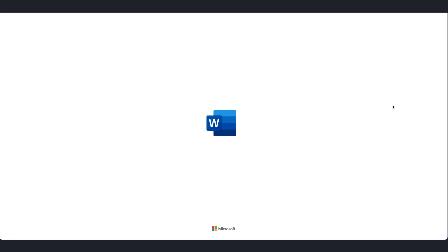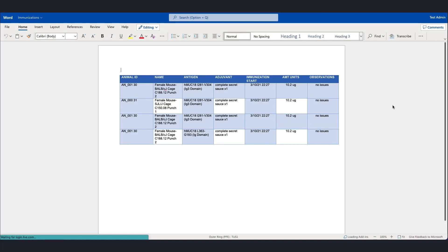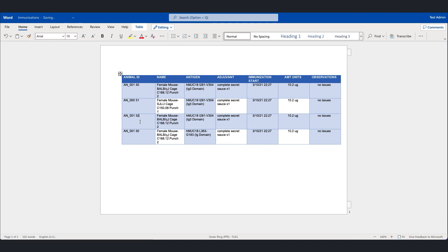So I'll first edit the Word document, in this case in Word Online, but if you prefer this can also be in the desktop application. In this case I noticed that a couple of the animal IDs are incorrect.